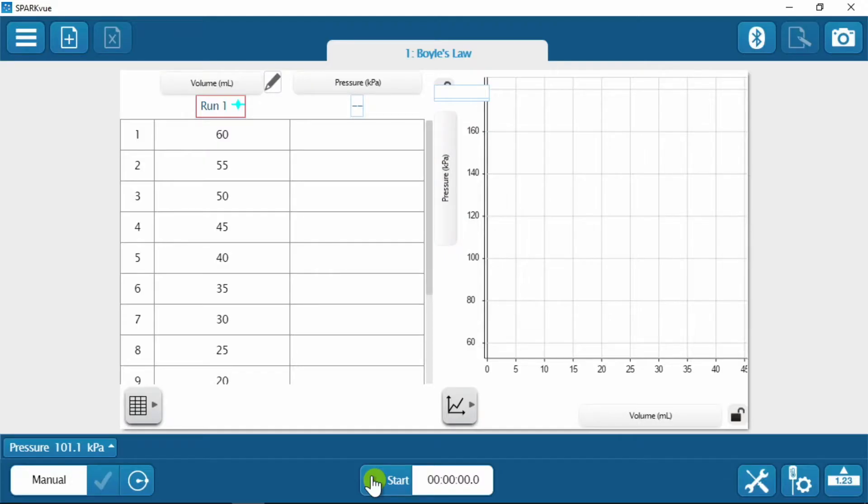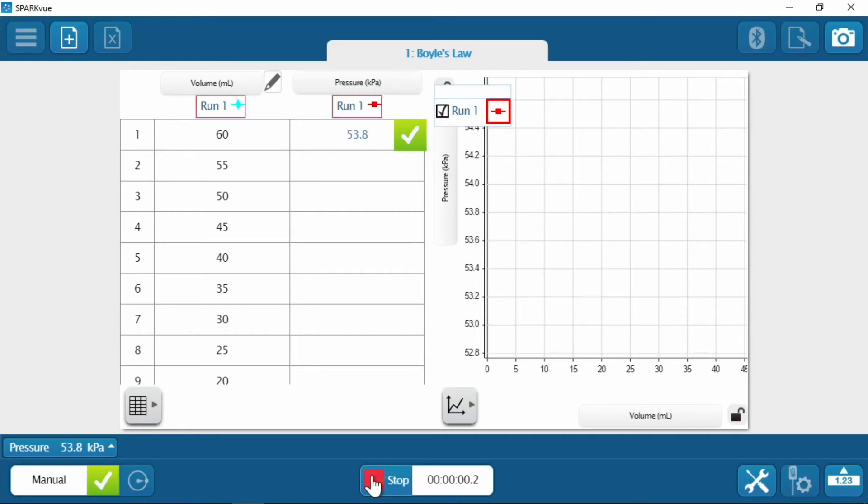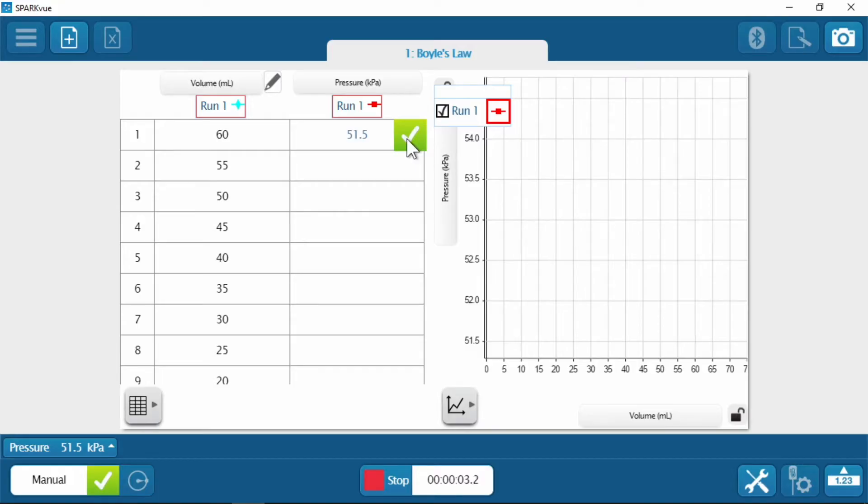First thing — I am going to put on my safety goggles. You're going to have to retract the plunger to 60 milliliters. I'll press the start button because I'm going to start measuring the pressure when you retract that plunger to 60. All right, I'm on 60.